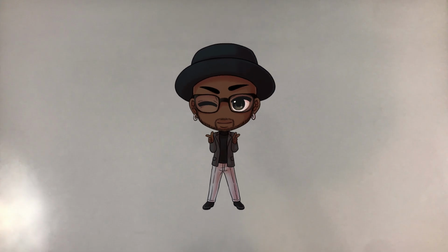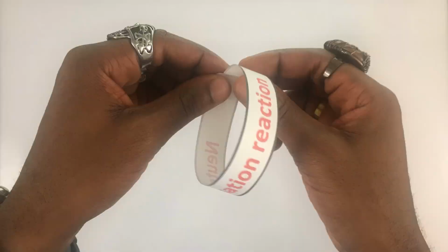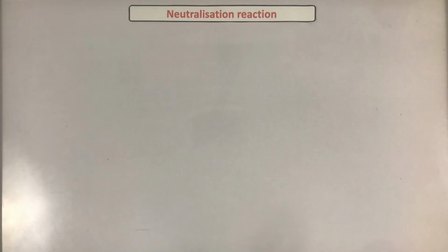Yes, it's Uncle Jegs, and this video is all about the making salts required practical. There's a bit of theory that we need to cover to be able to fully understand this practical, but it ain't that deep. The first thing we're gonna do is look at neutralisation reactions. I'll also go through how to name some of your salts.